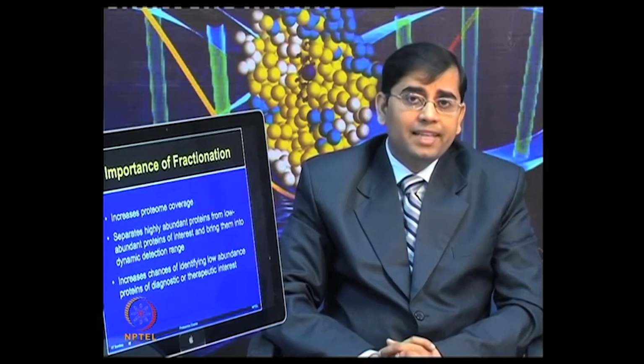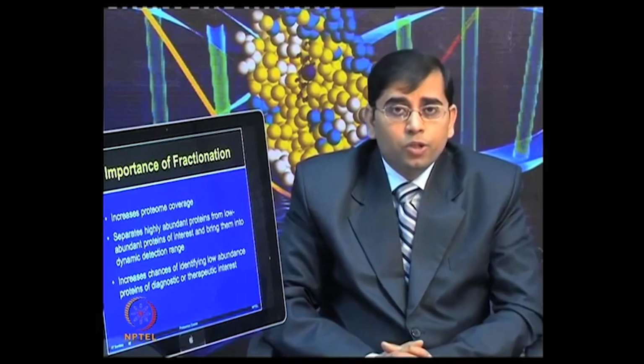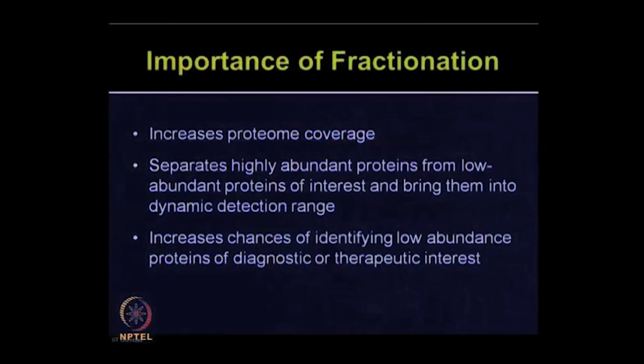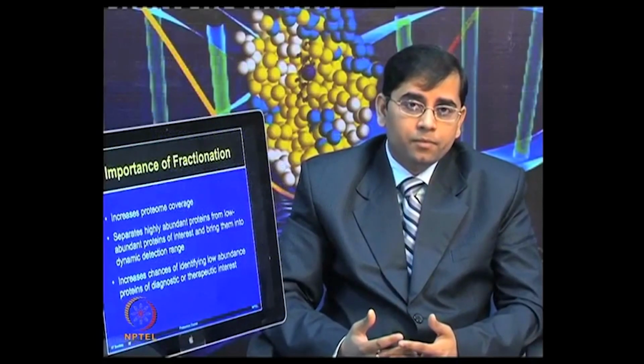Now, what is the significance of fractionation methods? The first most important thing is that you would like to increase the proteome coverage, analyzing as many proteins as possible from the given sample. An effective fractionation method separates highly abundant proteins from the low abundant proteins of interest and brings them into the dynamic detection range.